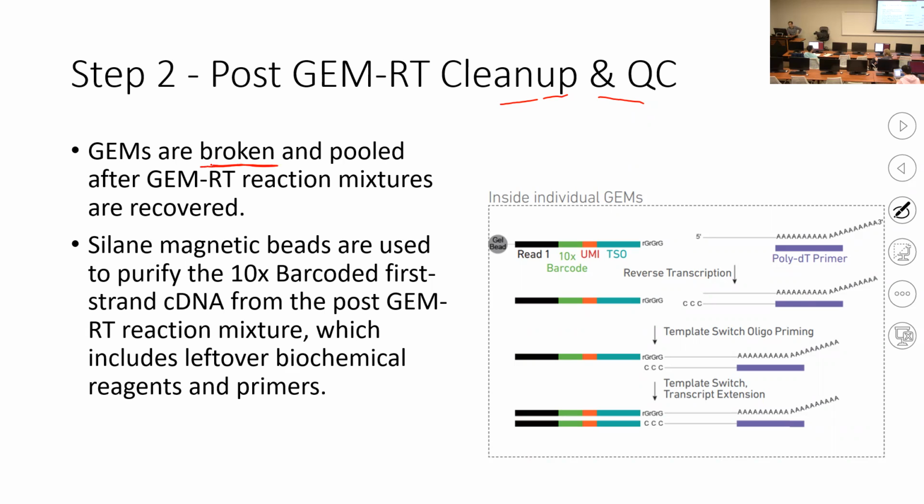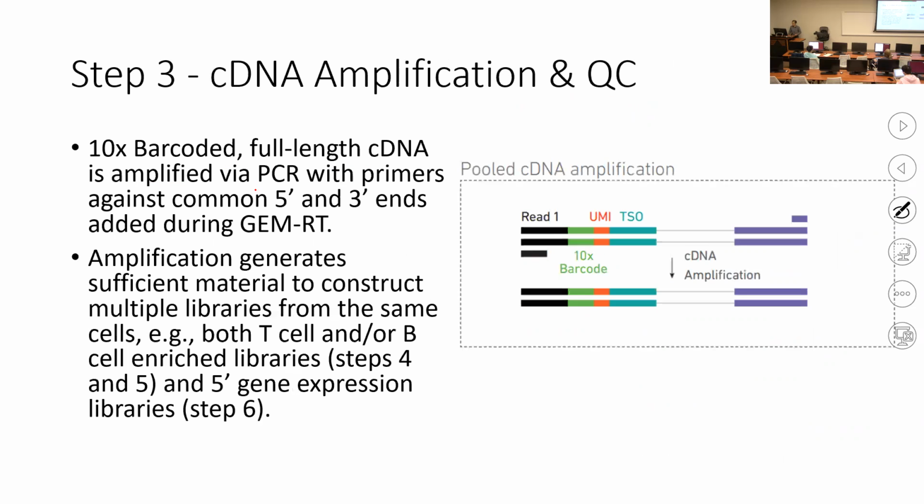After this, the droplets are broken and pooled, and you start to do the reaction in the mixture and then recover. Okay, step three, start to perform cDNA amplification.